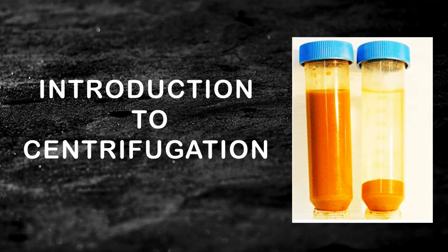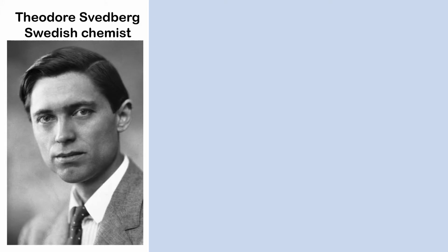So what is centrifugation? Well, if you have a solution that doesn't settle down under gravity on its own, then centrifugation is essentially the spinning of this solution vigorously to create something known as a centrifugal force that allows the particles to settle. This technique was in the very beginning implemented by a Swedish chemist called Theodor Svedberg. Now, this fellow was specially gifted in physics and chemistry, and in fact, he ended up earning his bachelor's degree within a year at Uppsala University.